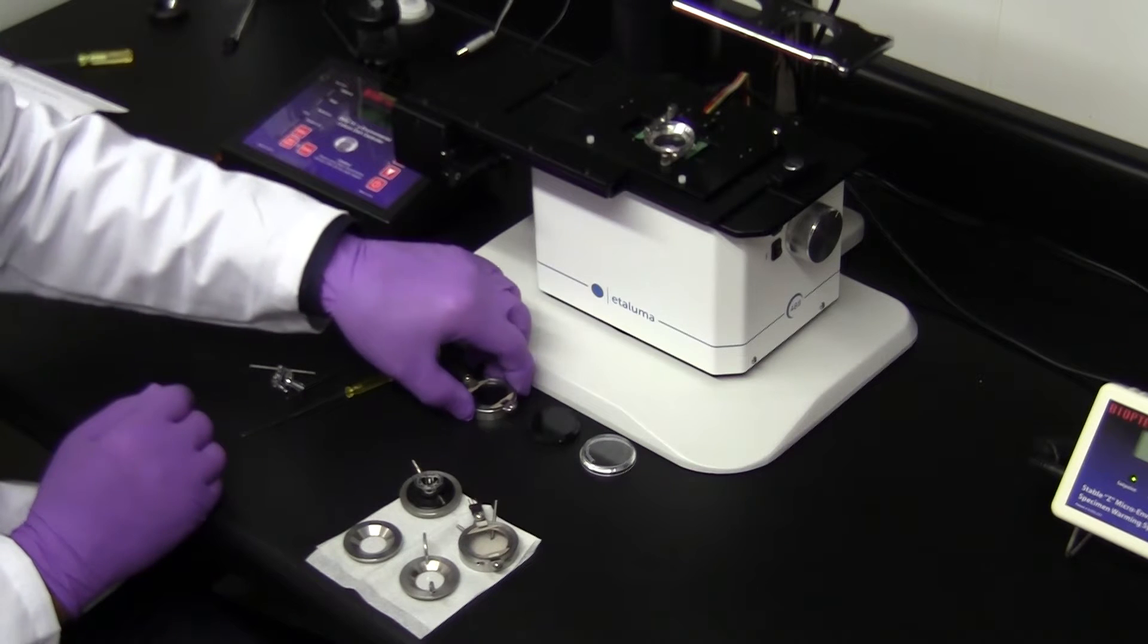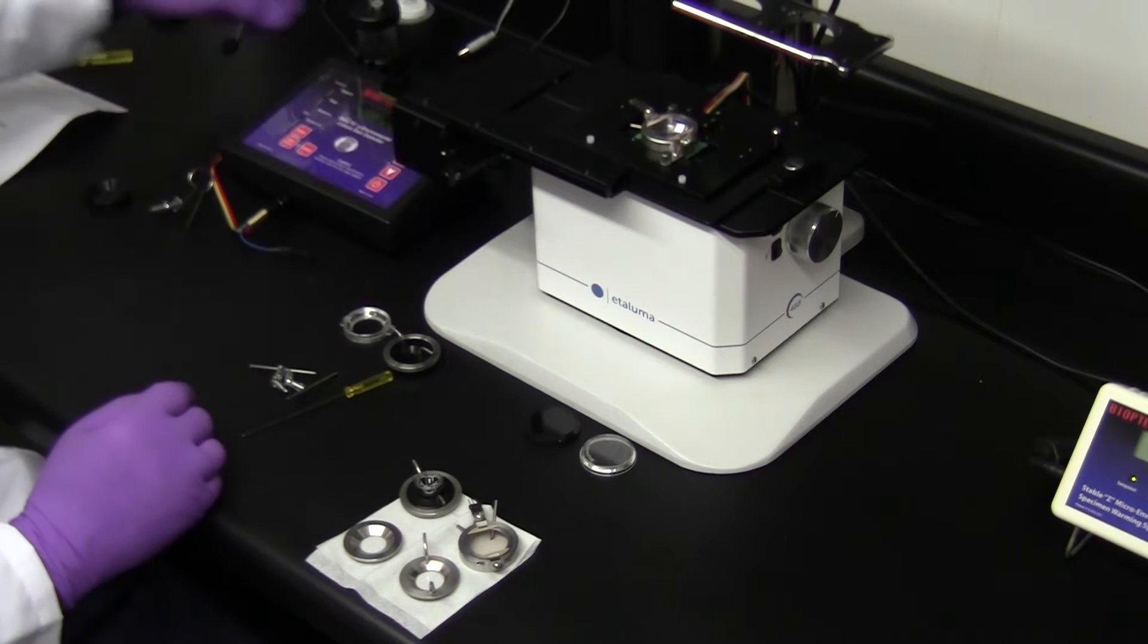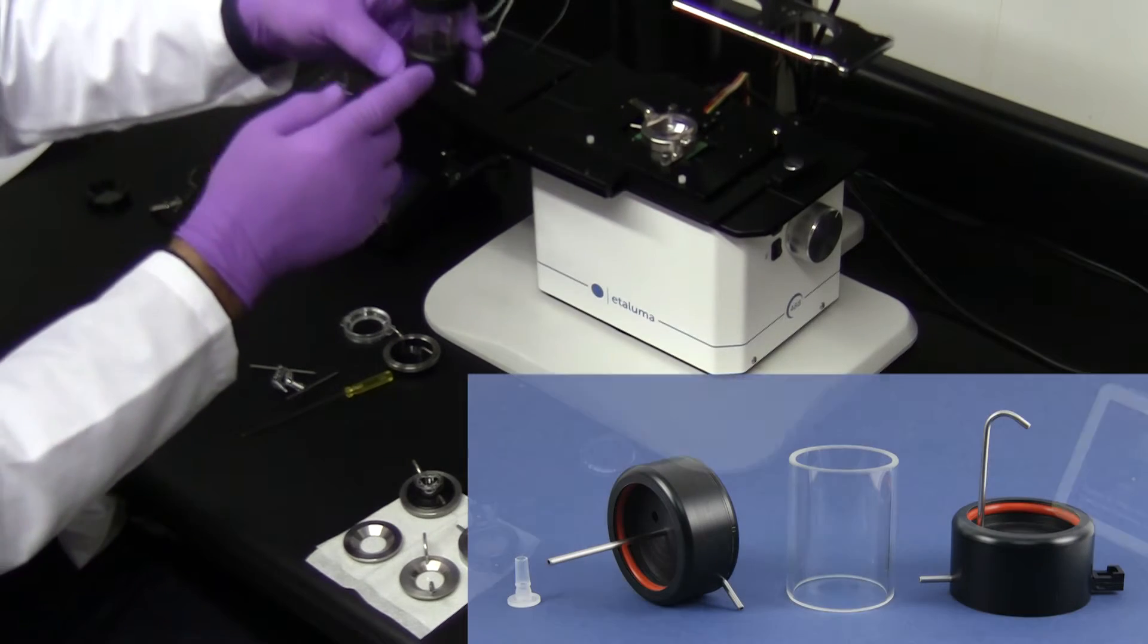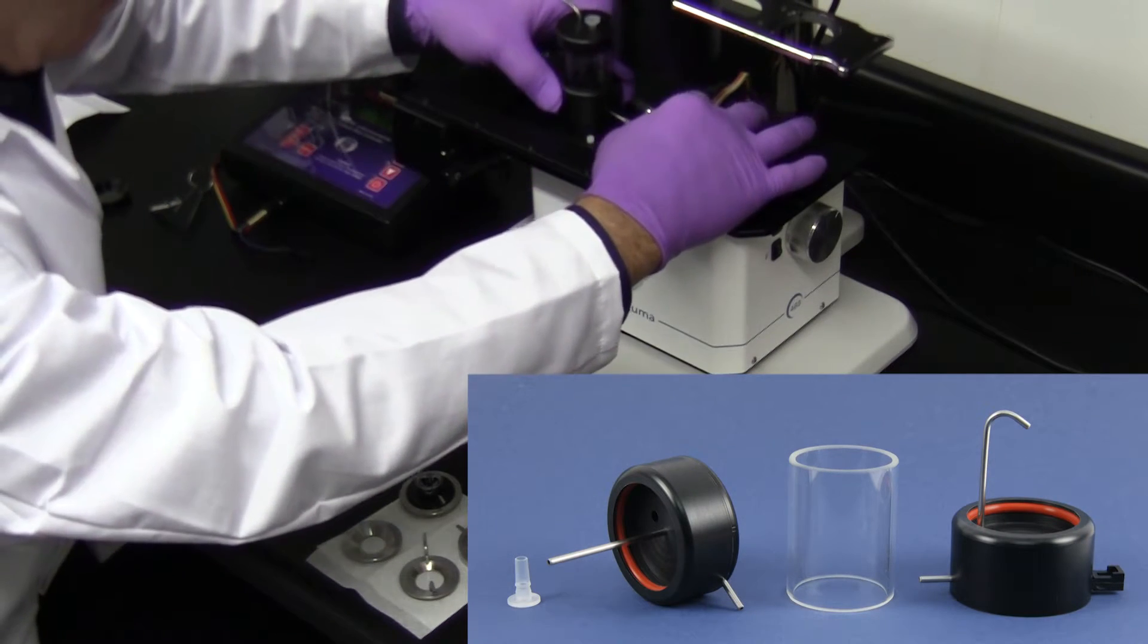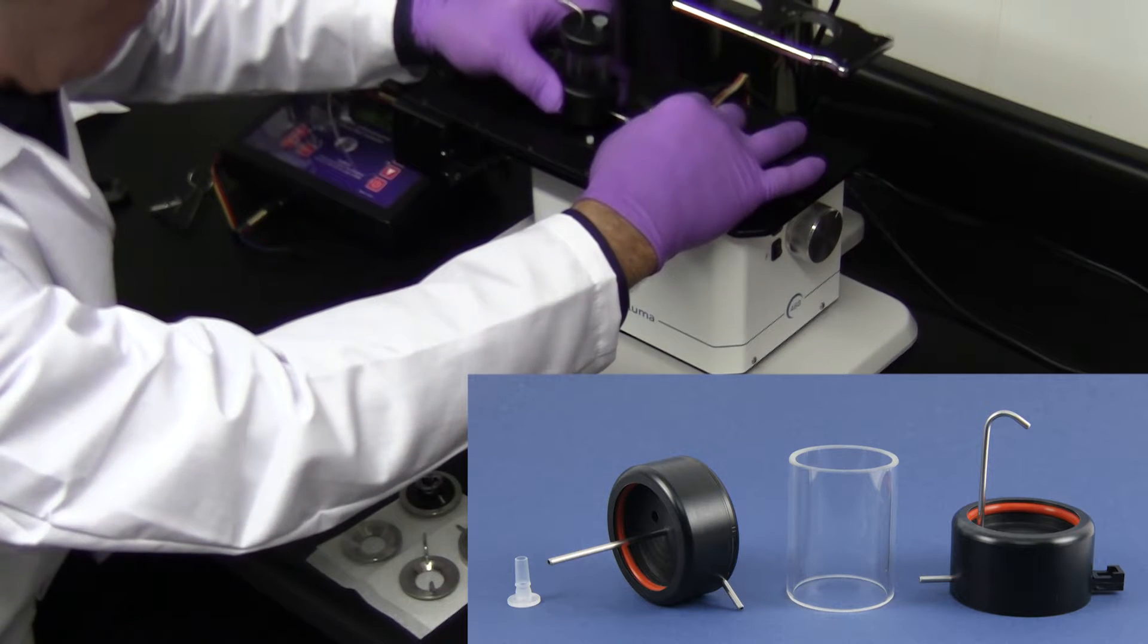For applications where the atmosphere above a specimen needs to be controlled, it is necessary to make sure the gas used is at 100% humidity. The Bioptechs humidification system humidifies any gas and takes it to the heated lid without loss.